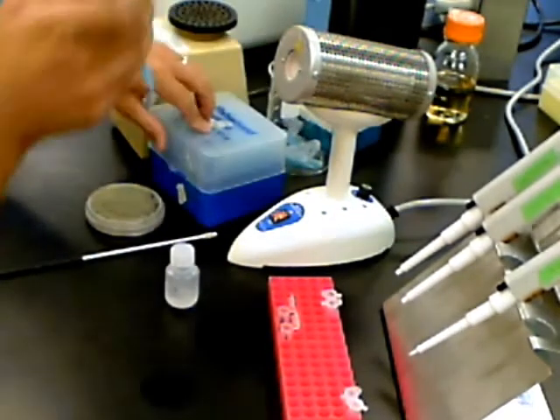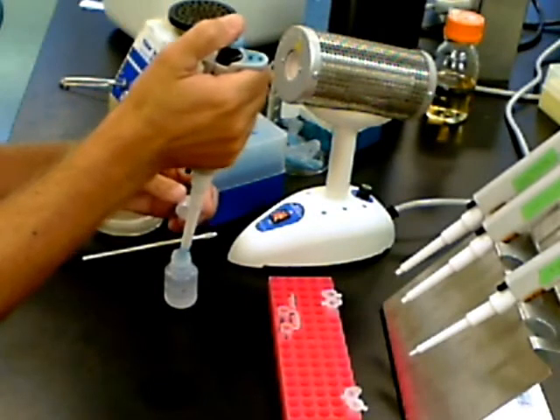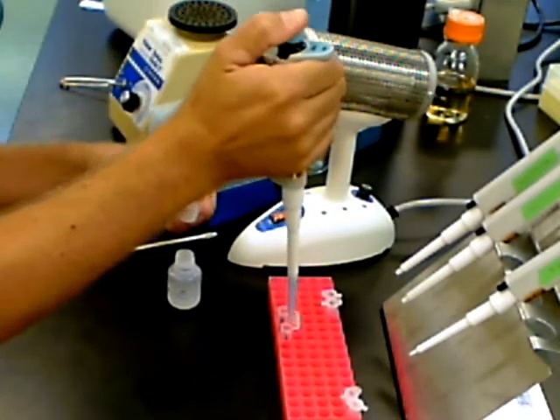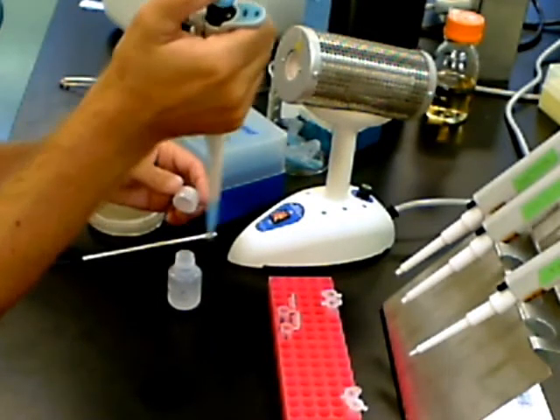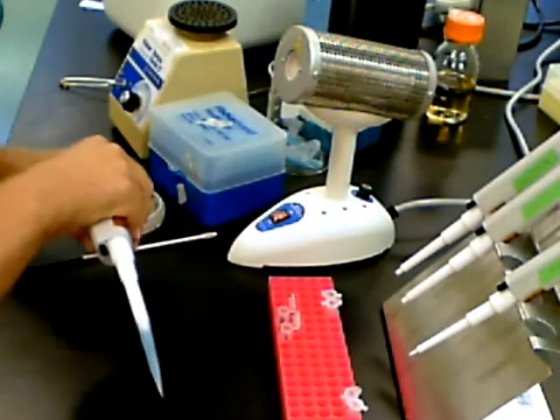Use a sterile one milliliter pipette and add 250 microliters of ice cold calcium chloride solution to each tube. The calcium chloride solution is used to make the cells more competent to be transformed, or to insert the DNA into the cell.